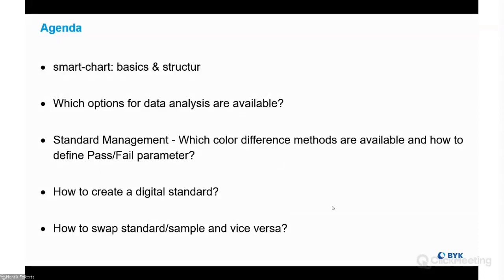I will talk about standard management. It's very important because in standard management, you can define, for example, pass-fail parameters. Those are parameters you have defined with your customers. I will show you how to do that and where you can find it. And one topic to highlight is how to create a digital standard.